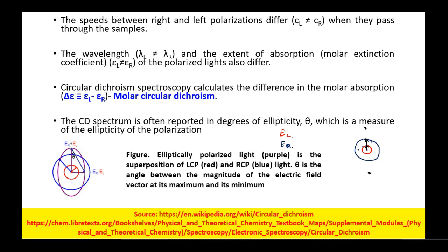And then at the 3 o'clock and the 9 o'clock positions, what will happen? The RCPL is moving in the right direction, and the EL is moving in the left direction in an anti-clockwise manner. If you consider ER at the 3 o'clock position, the LCPL will be in the opposite direction.